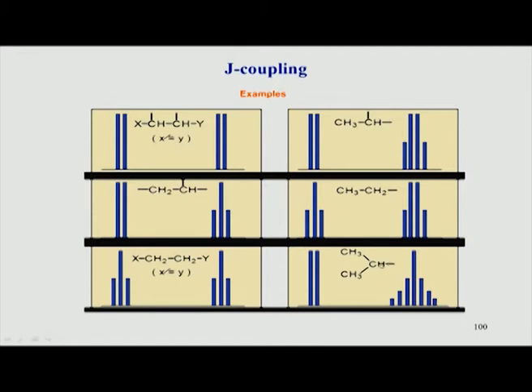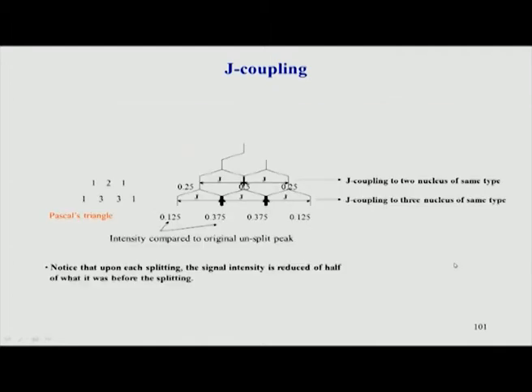On the other hand, this side hydrogen, because now it is coupled to 6 hydrogens, will become 7 peaks. So, you see this is how the n+1 rule works: 6+1 is 7. Again, remember, we will see the intensity pattern shortly, but the idea in this whole slide is to illustrate how this different splitting happens because of J couplings.